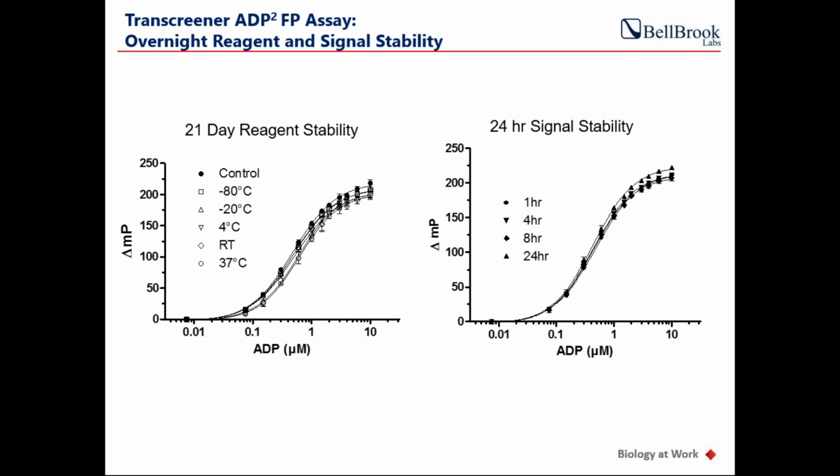Again, when we're looking at the signal, this is after quenching the reactions. Again, we're just looking at standard curves here. And you can see that the signal is quite stable as well. So if you're running a lot of plates and you can't do reads right away, and the plates are sitting on the deck for a while before they're read, it's not an issue.